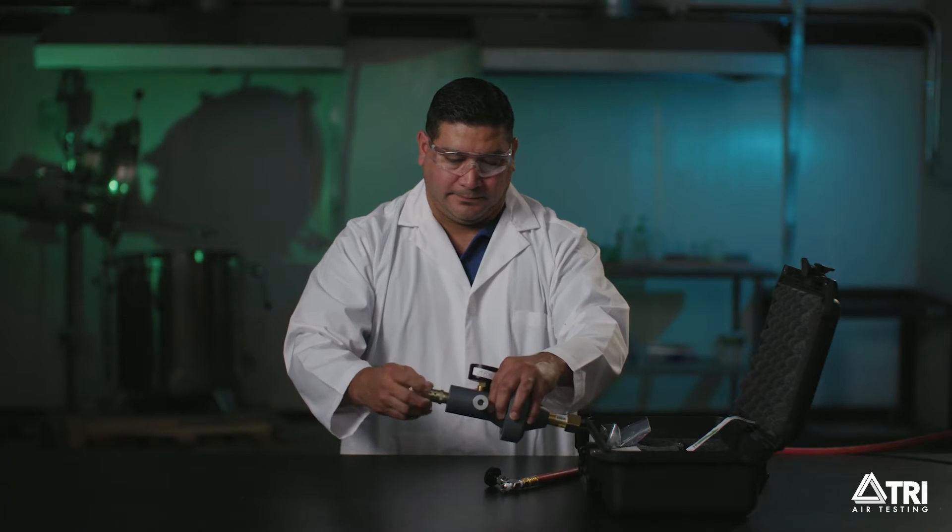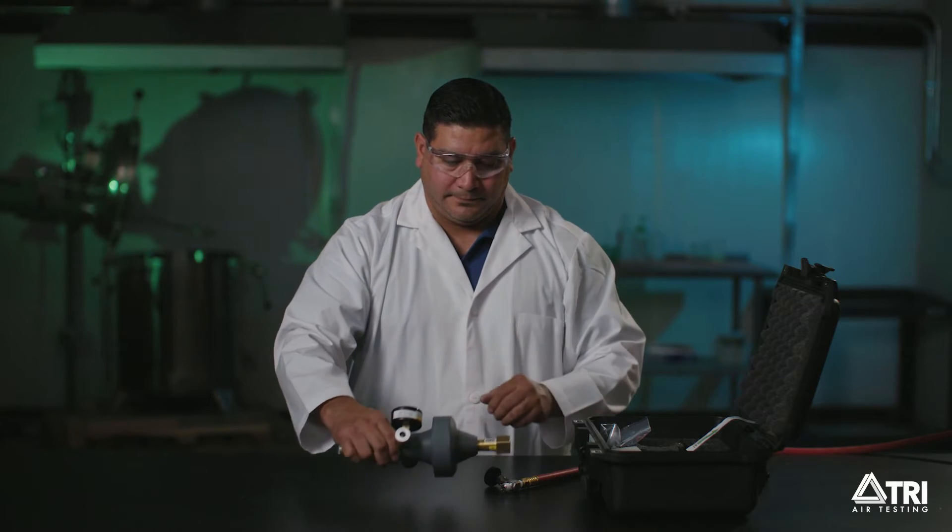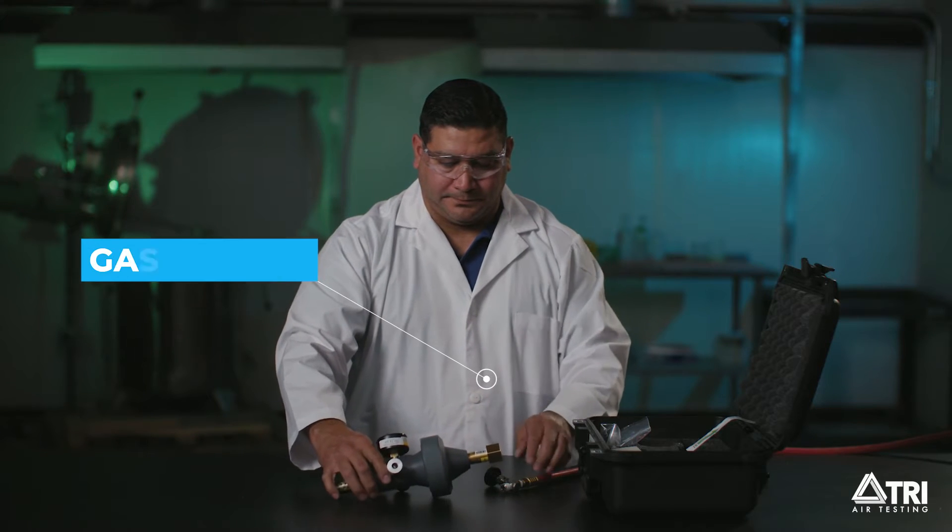Now open the charging lead or gas source valve located here and blow out residual moisture in the lines for 5 minutes.